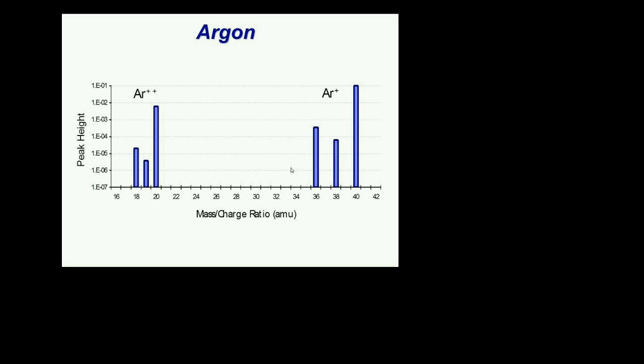And the other thing to keep in mind is the next step of sophistication: understand how things react with each other at the hot filament, so you understand which peaks are really just a manifestation of crosstalk, and also understand things like this argon thing. How does double ionization overlap with the peaks that I want to see, how fragments work, and so on.